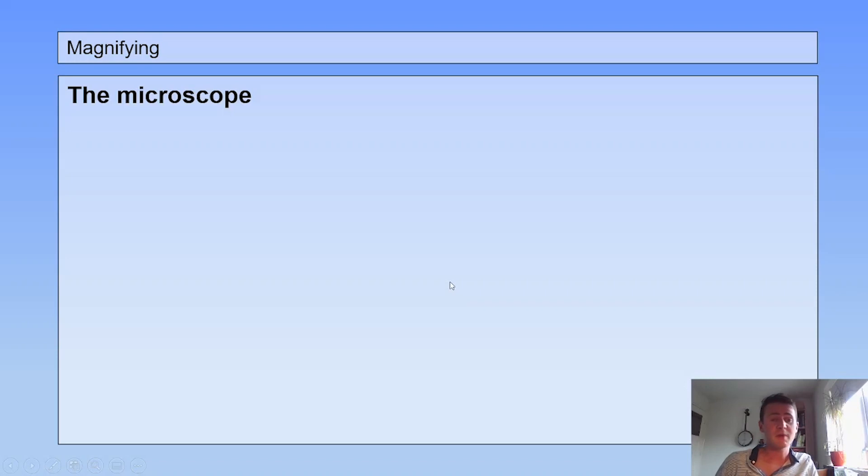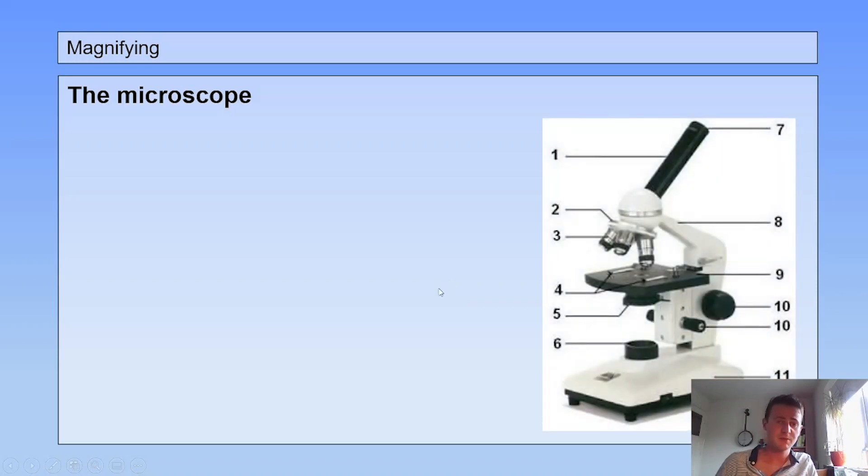The microscope. I will just list the names of the parts of the microscope. Number one is the tube, number two the revolving nosepiece, and with the revolving nosepiece you can change the different objectives.